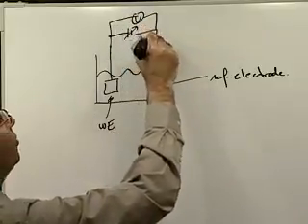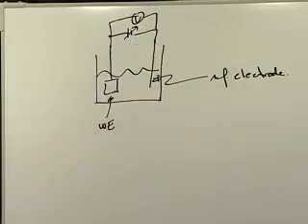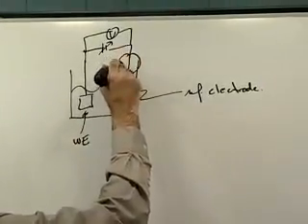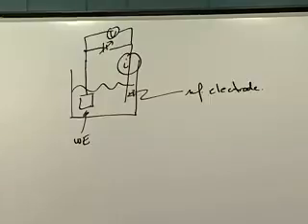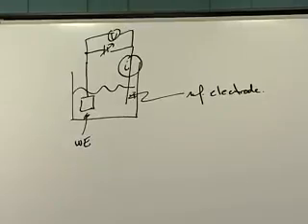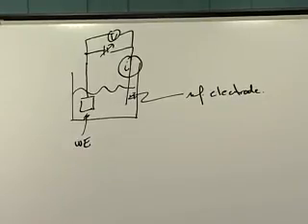Let's get a little fancier here now and insert an ammeter so we can monitor the current also. So right in the circuit here, we'll put an ammeter in. Ammeters go in series. The current goes through them. They're a low impedance device, low resistance. Voltmeters are in parallel. They're a high impedance device. We're not carrying any current through there.